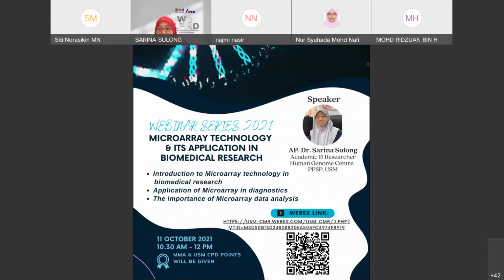Okay, that's a very good question. The main difference between NGS and microarray is the purpose of the function itself. With NGS you can detect point mutations, or very small deletions or substitutions. NGS also has the targeted approach and also whole genome or whole exome. Microarray, as I mentioned, is also a whole genome approach, but you cannot detect point mutations. You can detect genetic aberrations, whether in gene expression, where you want to see changes in the expression level, or changes at the DNA level, whether there is copy number variation, any gains or any losses. You can see segmental deletions or whatever.